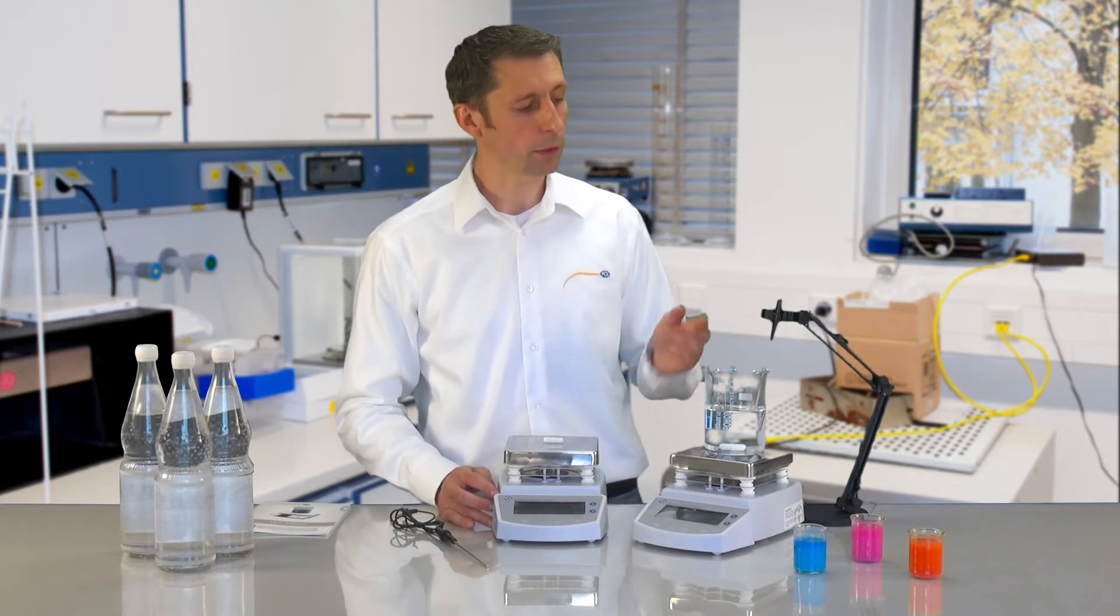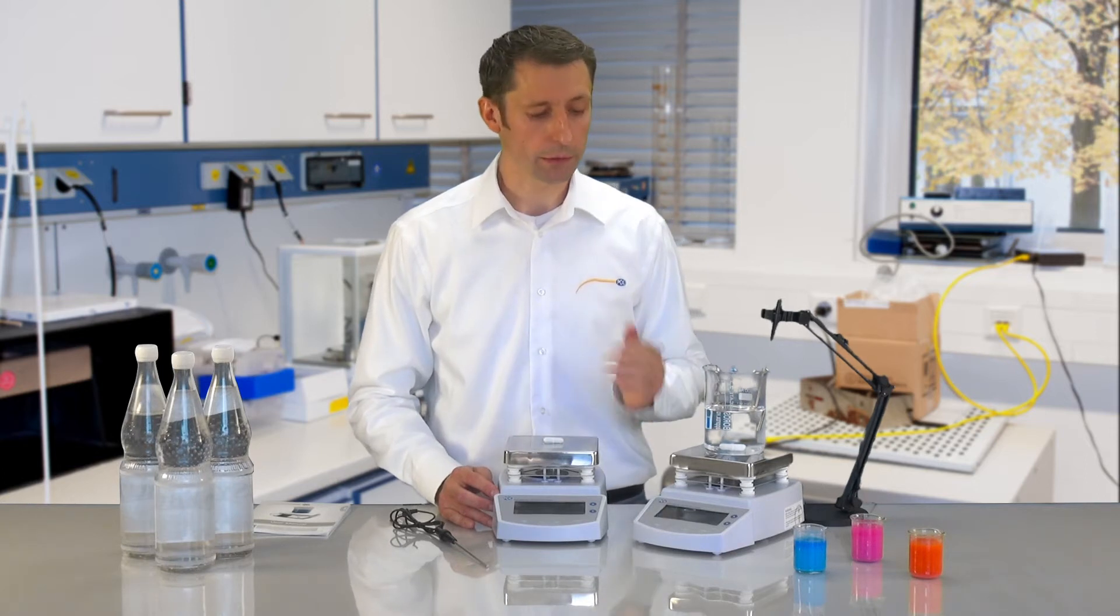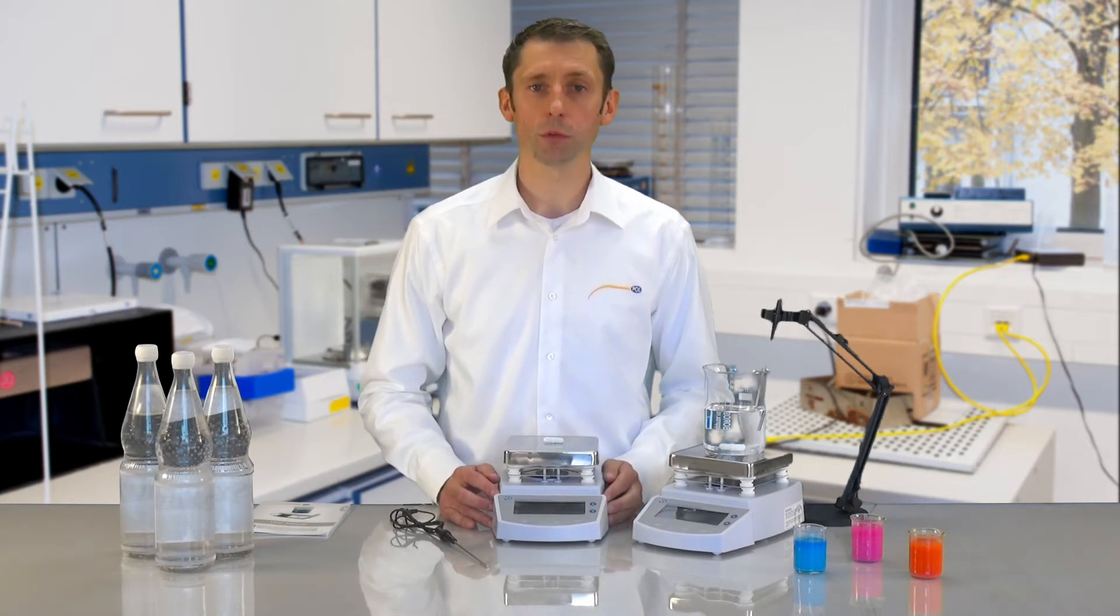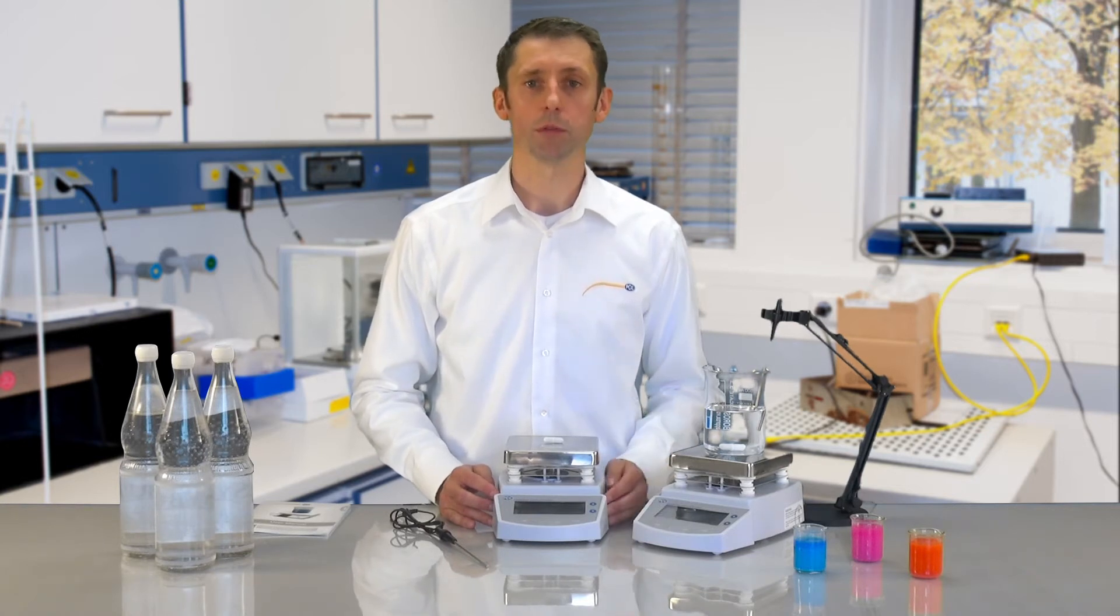The temperature is regulated by the external temperature sensor. A further function is the time-out function of the magnetic stirrer. Here I can set it between 1 and 999 minutes.